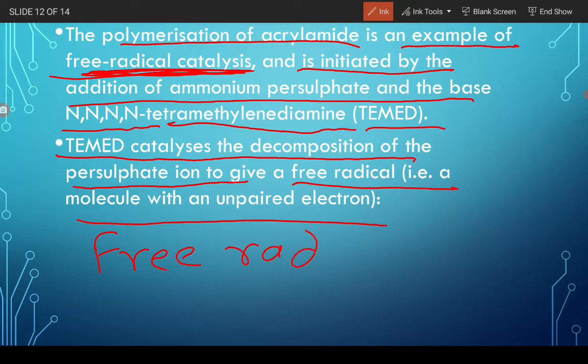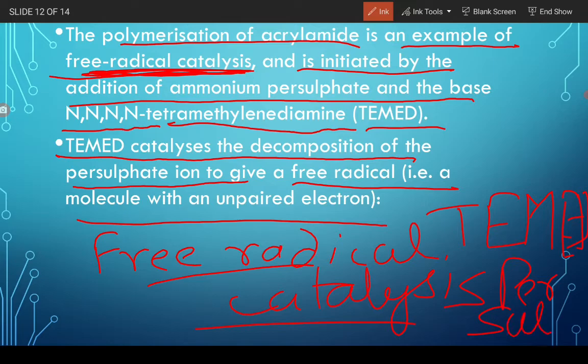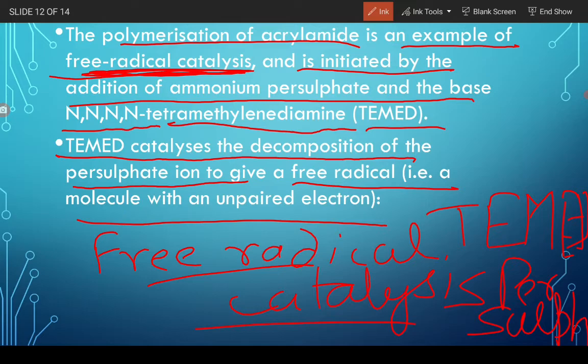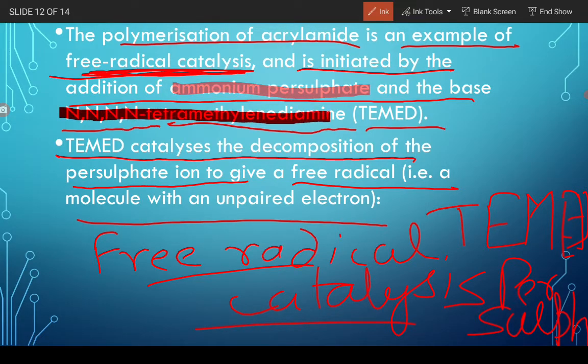For this type of catalysis, TEMED and persulfate are required.